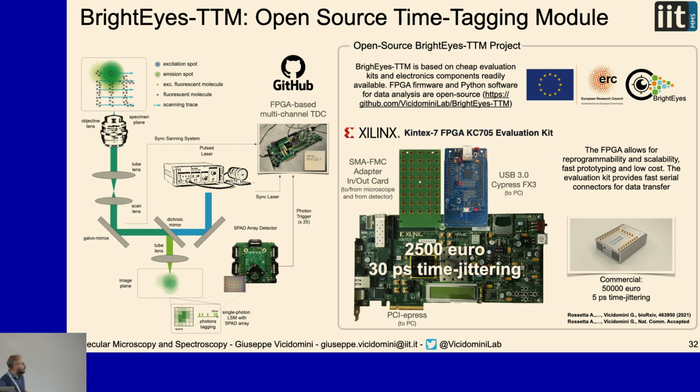So we decided internally to develop our own time tagging data acquisition system. I'm just telling you this, I don't want to go into detail, but it's an open source project. So if you are interested in doing lifetime with a SPAD array, but also without a SPAD array, you can contact us and we can save you money.